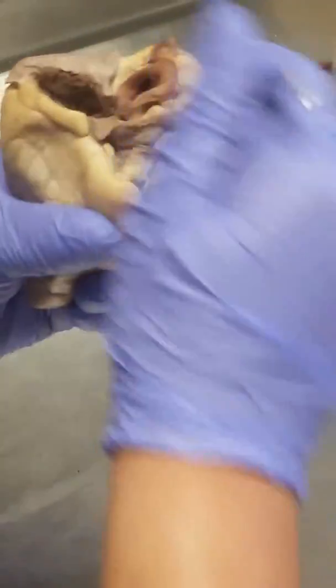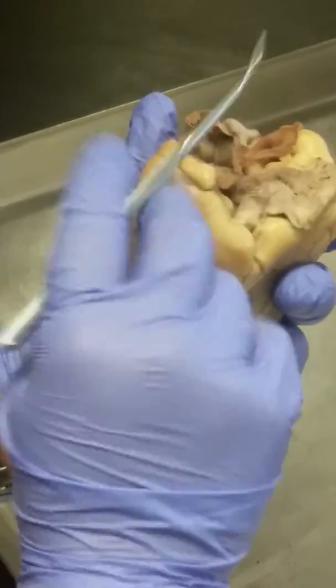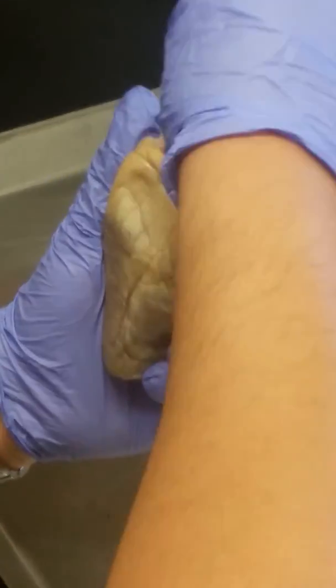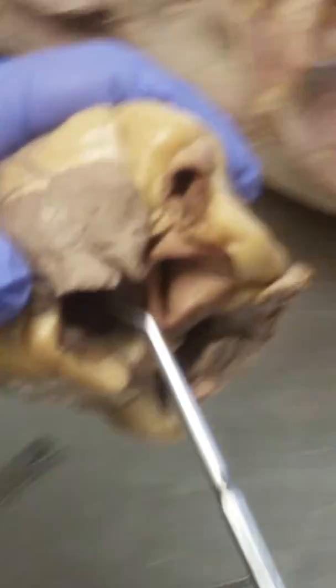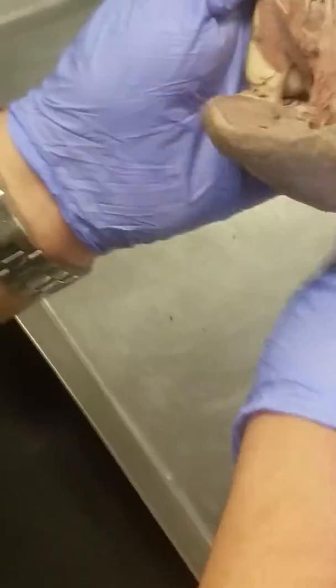So, this portion here, this is where the pulmonary veins should have been, but they cut the veins out, right? Which means what is this chamber that I'm in right here? What is that chamber? You guys see it? What is that chamber right there? Who said it? That's the left atrium. See? That is the left atrium. Because now I go through the bicuspid valve.